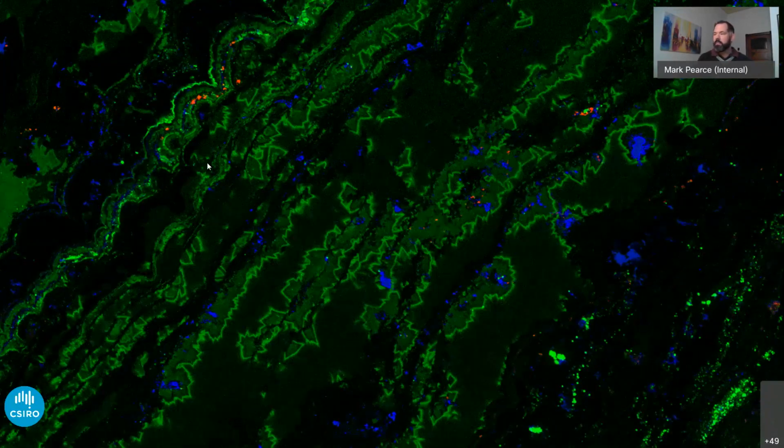So we could take each of the lead-rich regions and we can look at the elements around it and collect a kind of neighborhood of what that chemical environment is and start doing statistical analyses on these so that we're actually able to confirm what's representative of particular elements in minerals. And that's one of the big advantages of these data sets, is that we can actually look, before we do that microscale analysis, at the representativity of what we're analyzing.